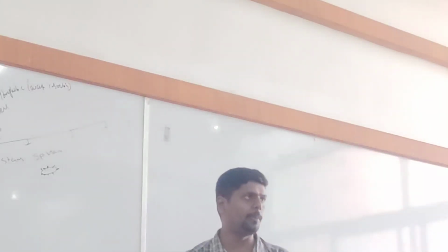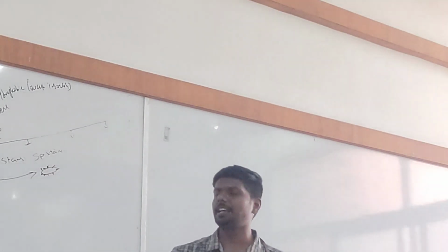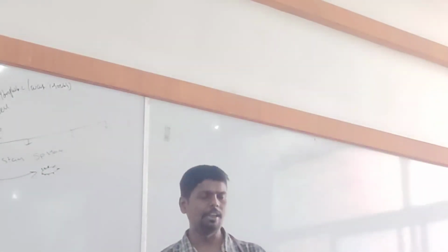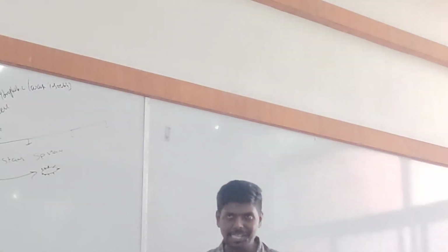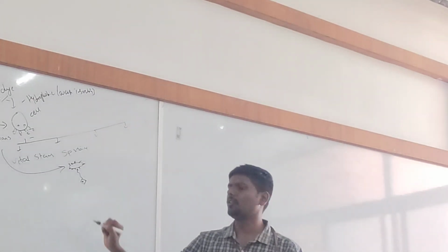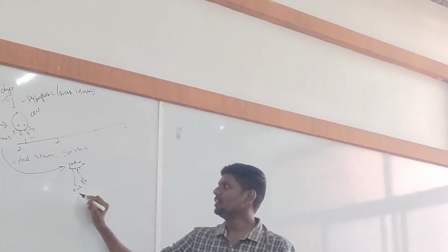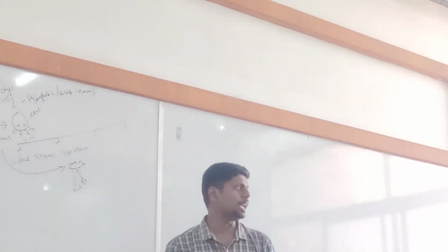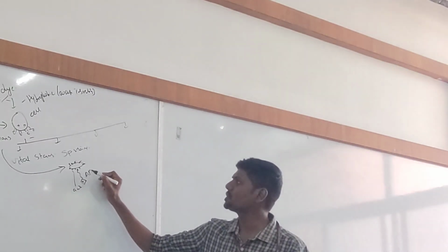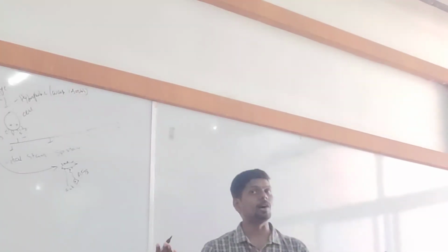That means even normal stains cannot penetrate into this bacilli. Due to this nature, I need to destroy the cell wall first with the help of phenols. Then I will use very strong acids to penetrate my dye into the cell wall. And this bacteria is called acid-fast bacilli. Can you guess what is the bacteria?